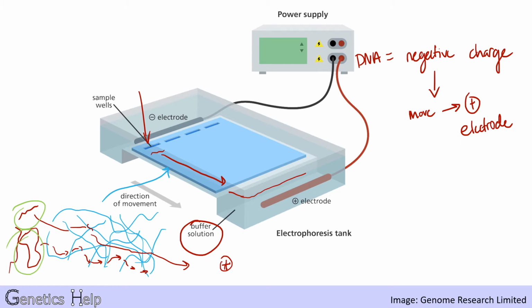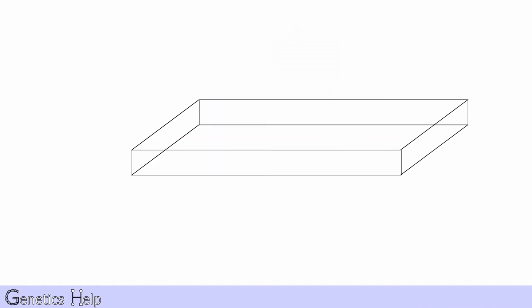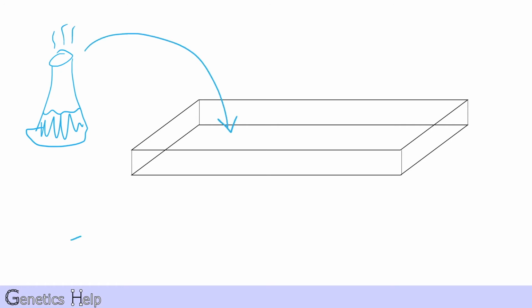So let's look at what's going on here. Here's an example of a casting, very simple. We have our cutout rectangle and we have a flask here, and our flask contains our agar. Here's our agar. It's very hot, we just heat it up and we're going to pour it inside. Just some things to know is that the agar contains a substance that binds to DNA.